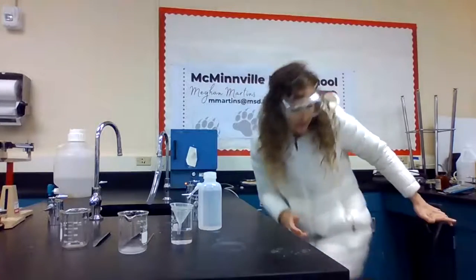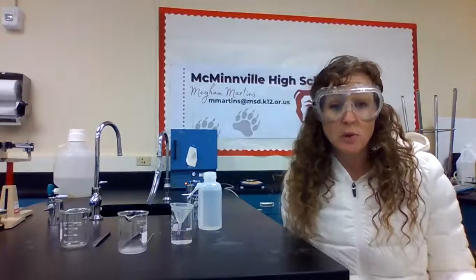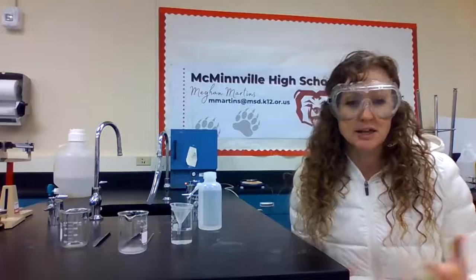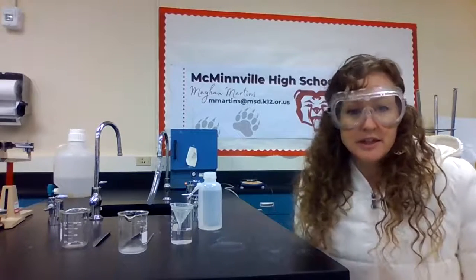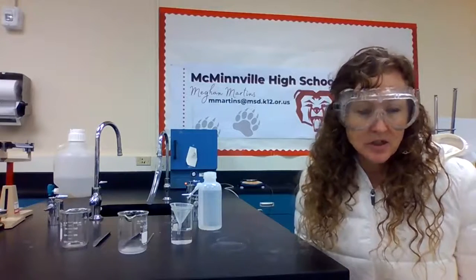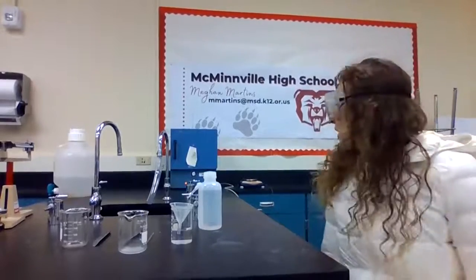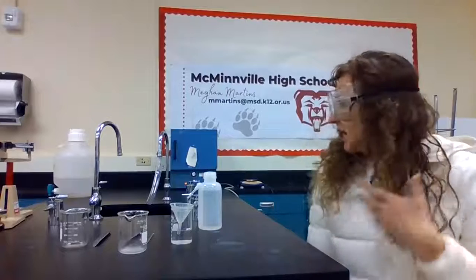Now there's a couple of considerations when using a drying oven. You want to dry your sample. You don't want to cook your sample, right? We don't want to heat it up so high that it's going to start to decompose on us. The other thing that could lead to cooking is just leaving it in there too long. It depends on what your sample is, whether it would decompose under heat or prolonged heat.